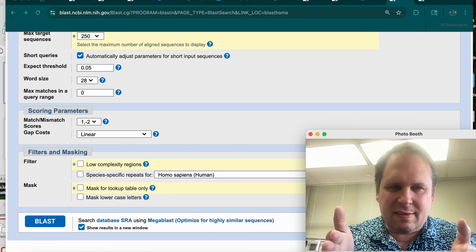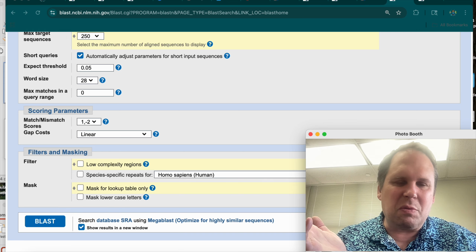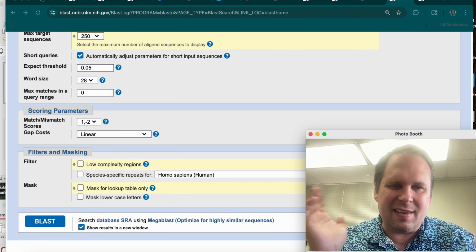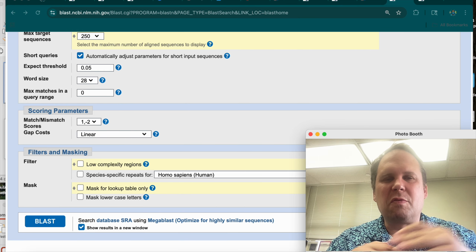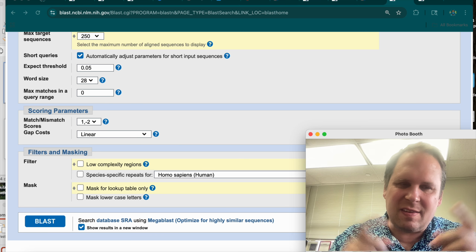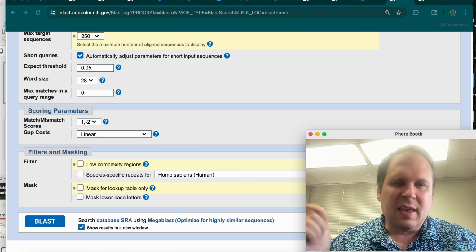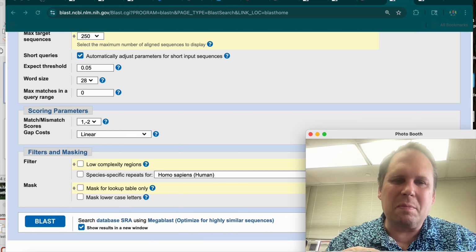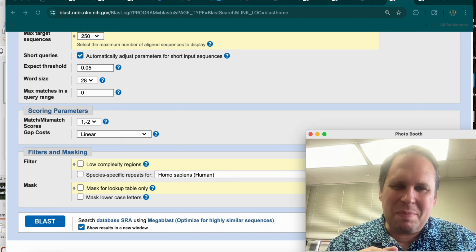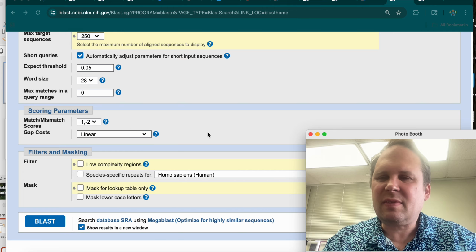So you'll get a sense with your data set for how deep this virus is. And there may only be 25 reads that will extend what you've got, in which case it doesn't really matter. You can put 100 in there and you'll still get all of them. But if you have really high sequence coverage, like 10,000 sequences for each little part, then you may need to go more like 1,000. You will just have to figure it out, and it's not going to break if you pick the wrong number there. You'll still be able to inch along, but it's going to go faster if you've got lots of sequences to pick from. That's what you want.